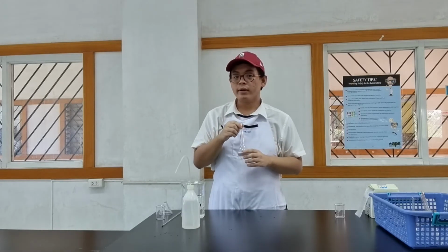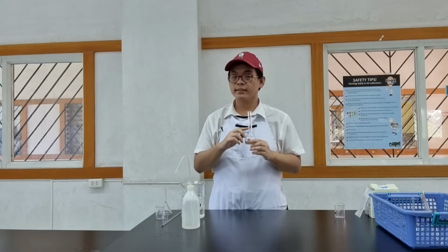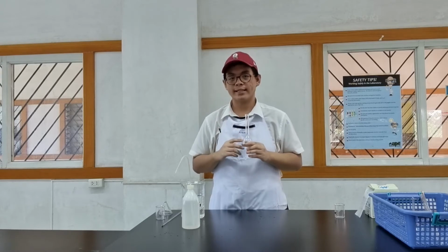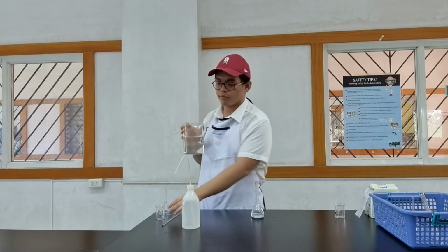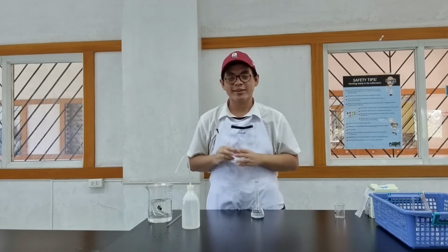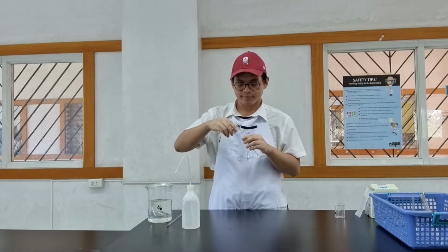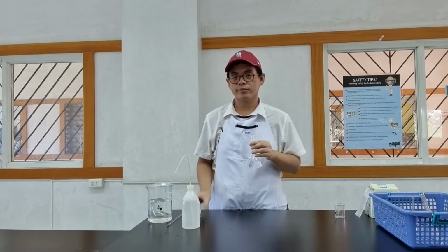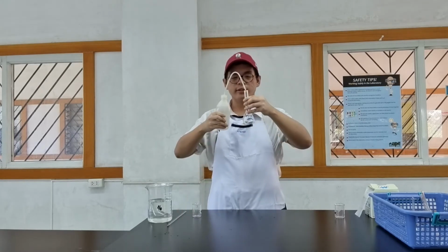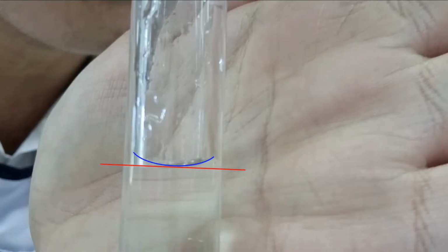What I need to do now is to dilute this to the mark. Again, after I dilute it to the mark and mix it, it should be 100 ml because this is a to contain glassware. This is distilled water. I'm going to transfer into my small beaker. I will use the small beaker to add liquid into my volumetric flask. Now, some people would like to use a wash bottle instead. That's totally fine. Make sure you're reading or looking at the meniscus at the eye level.